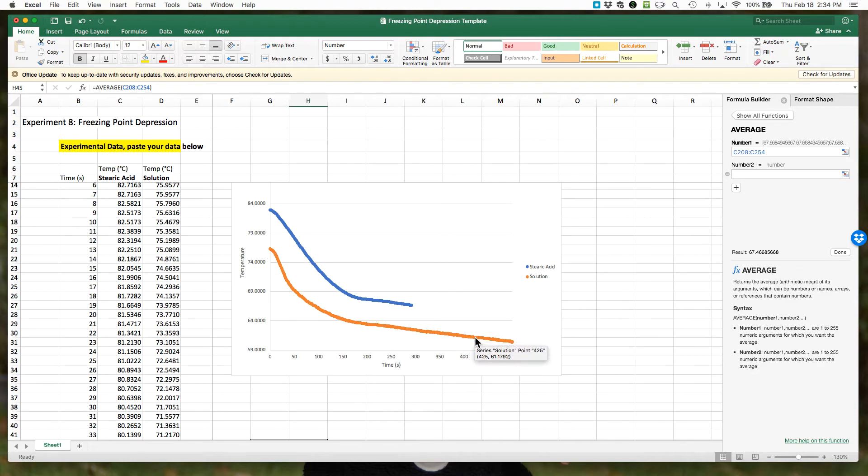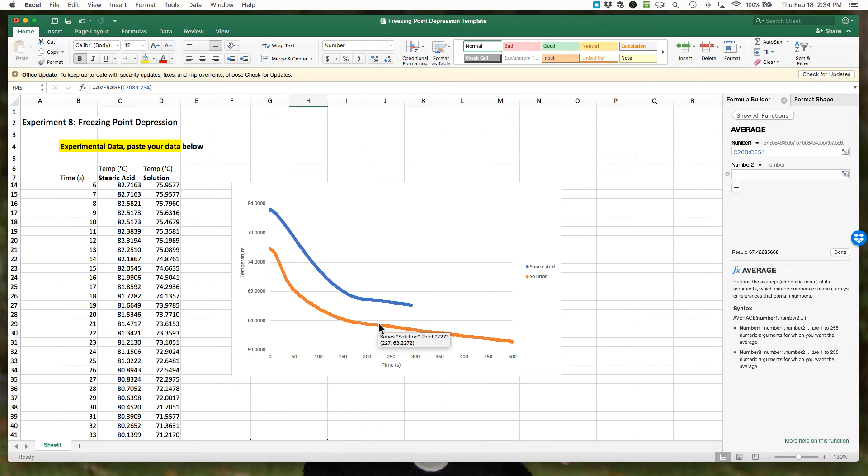That's probably the solid cooling, so you have to examine your data. I'm going to go from about maybe 198 seconds, and I'm going to only go to a pretty similar, maybe 231. So 198 to 231.